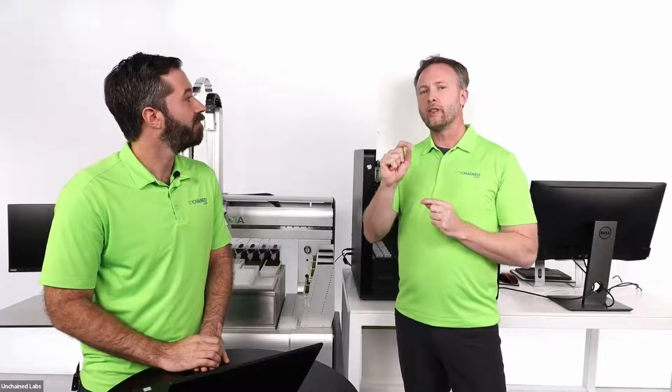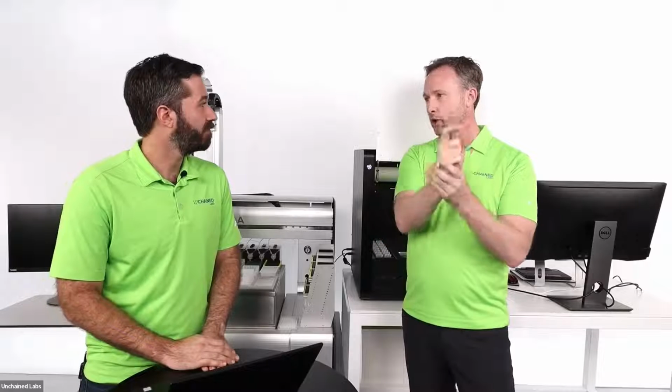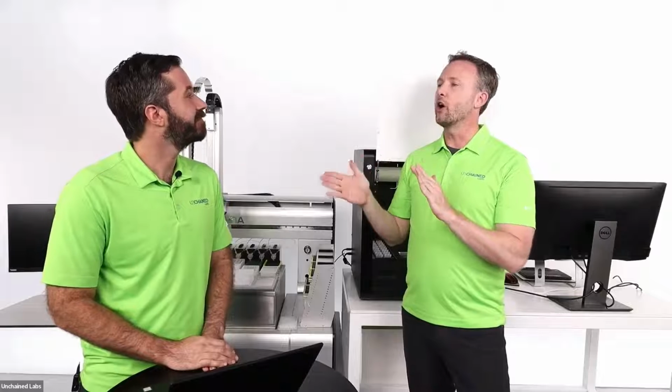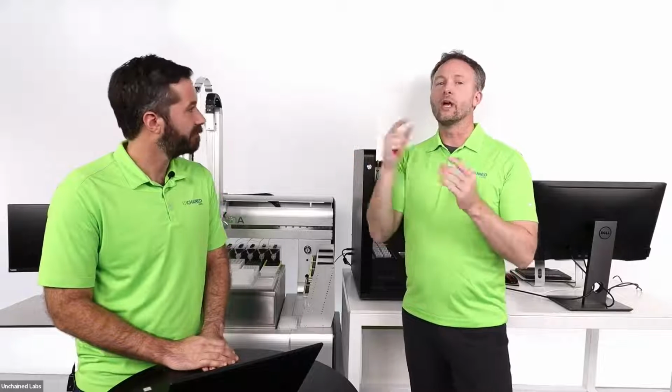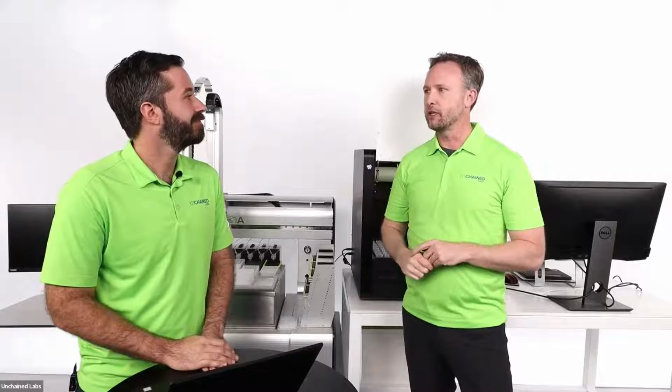Really the way that we do our concentration on both platforms is more by the volume. So let's say you know your starting concentration, and if you need help with that, we have other products like Stunner and Lunatic, which can help you there. If you have the starting concentration, it's really just the final volume that you want it to go to. So can you get it to your specific concentration? Yes, just pull up your little calculator, do a quick calculation, and you'll know what that final volume should be.